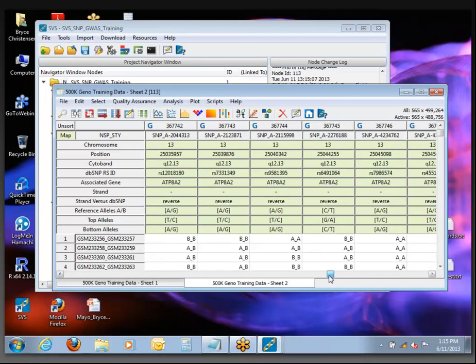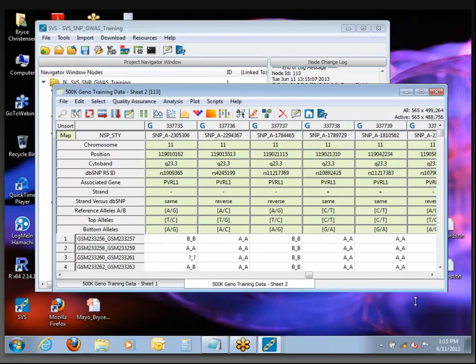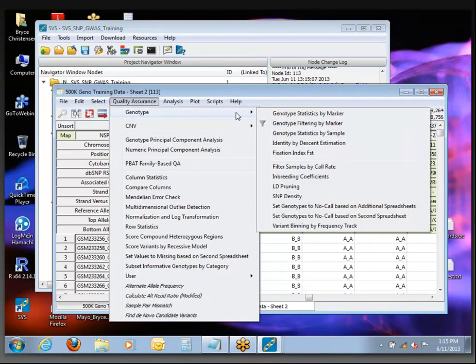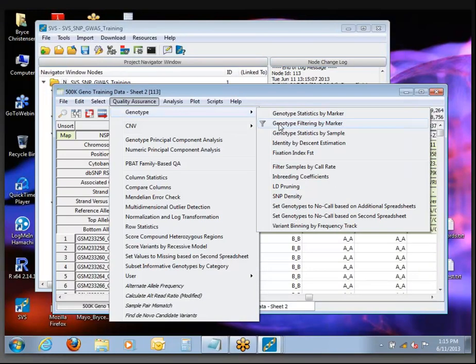If I scroll back over into the autosomes, everything remains active. The next step is to apply some quality filters on the data. In the Quality Assurance menu, under Genotype — this should be a familiar place — the second option in the list is Genotype Filtering by Marker, with the little funnel icon next to it as a visual cue.